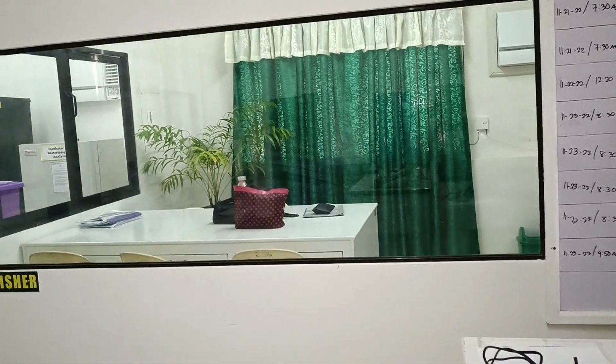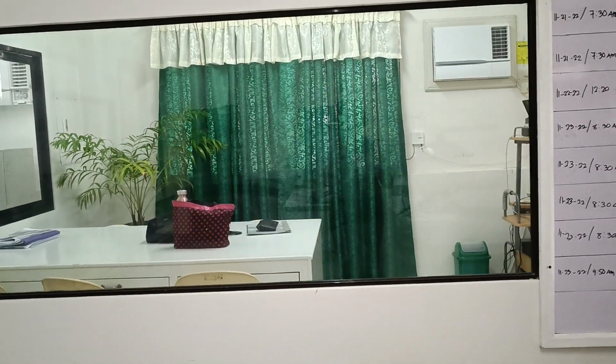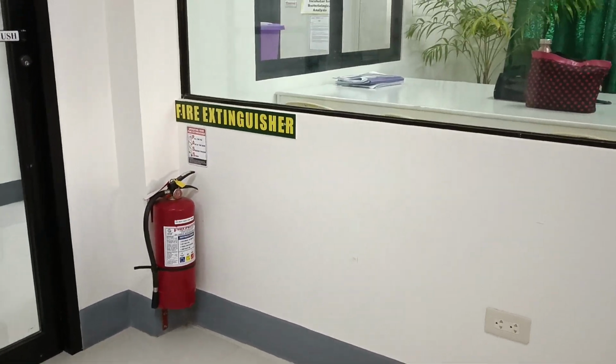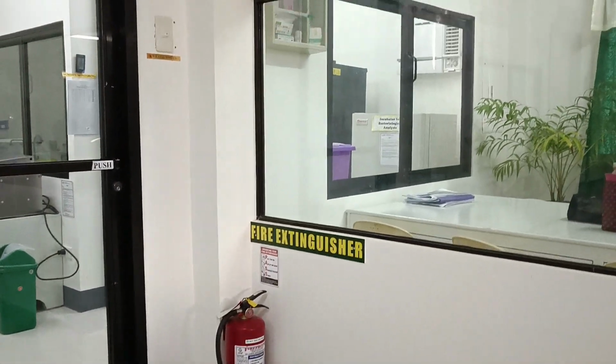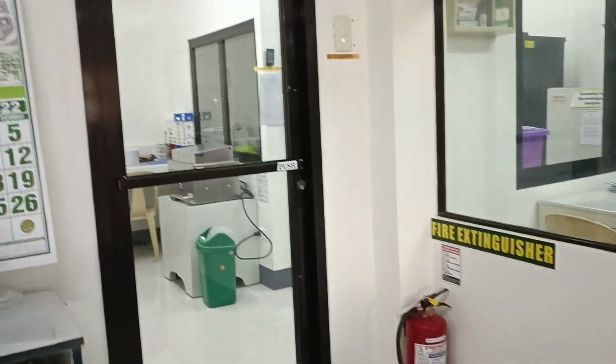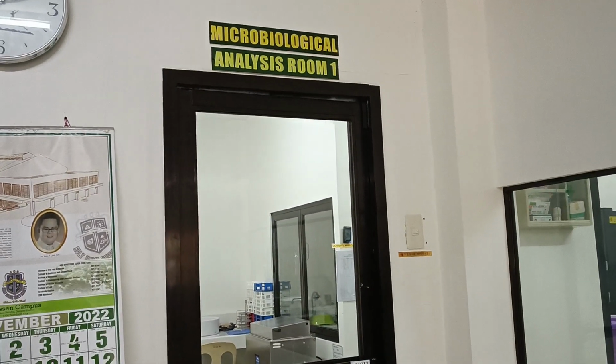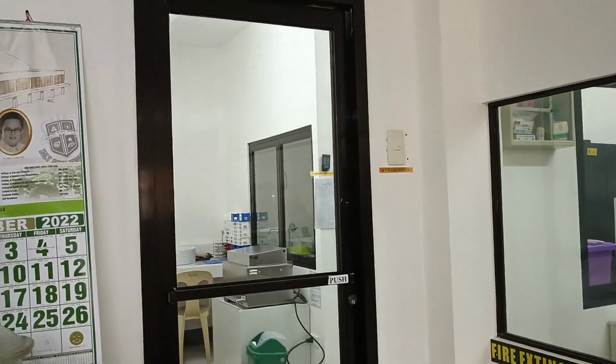And this is another glass panel. And down below is another fire extinguisher. This is now the door going to the microbiological analysis room.